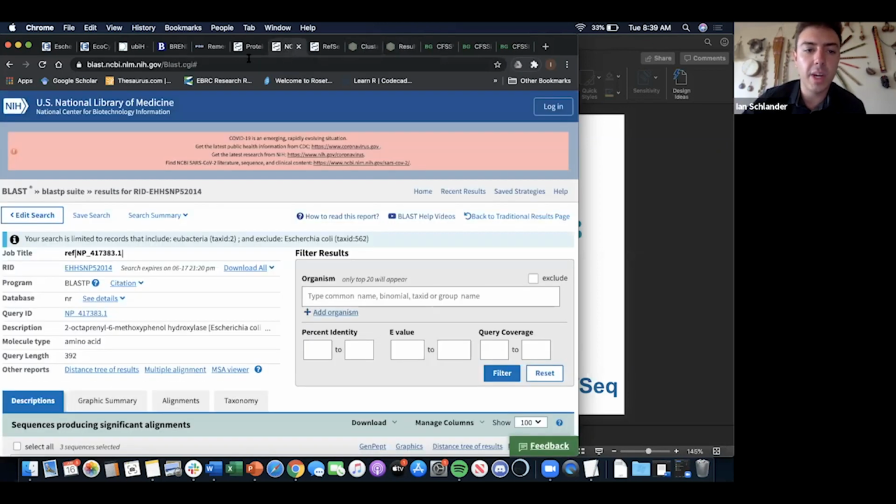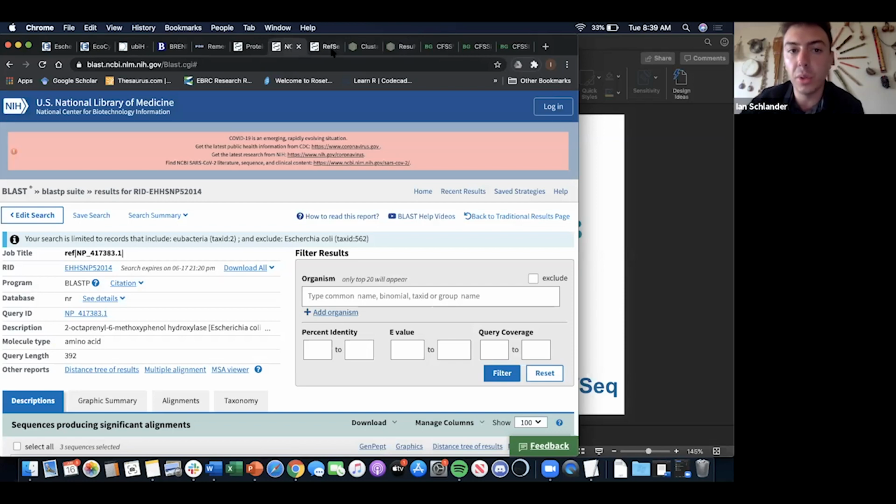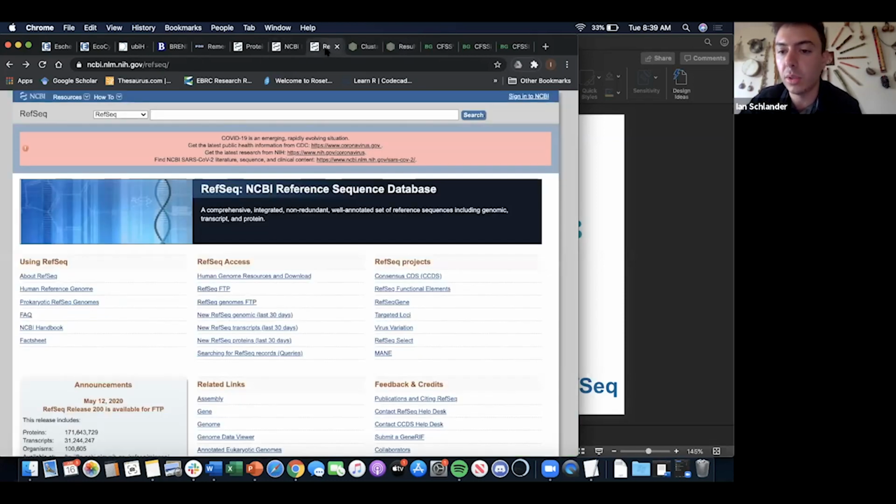And let's go back to the NCBI. Let's say you do choose your protein, and finally you want to start messing around with it in SnapGene or whatever software you use to engineer your plasmid and basically begin to enter the lab with it. So what we're going to do is type in FISB E. coli.